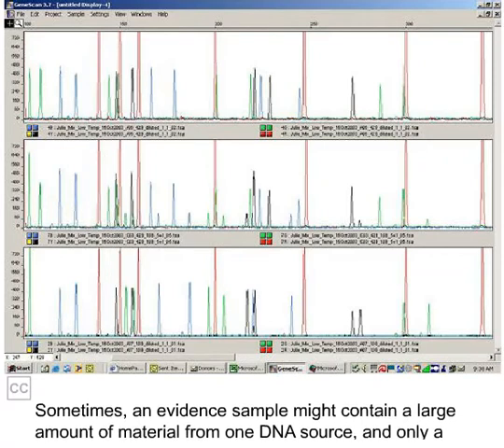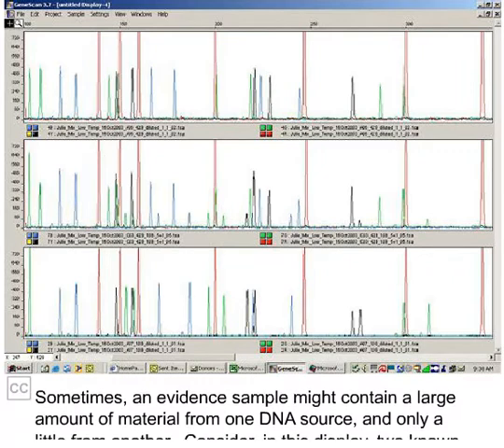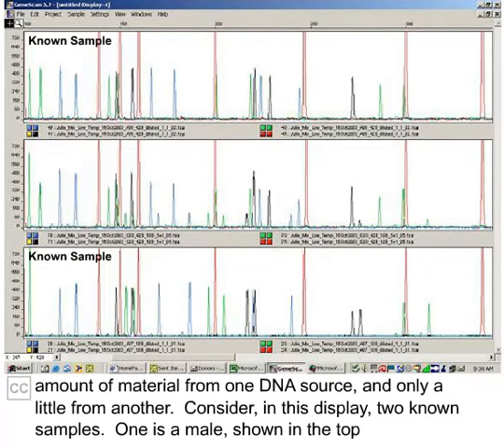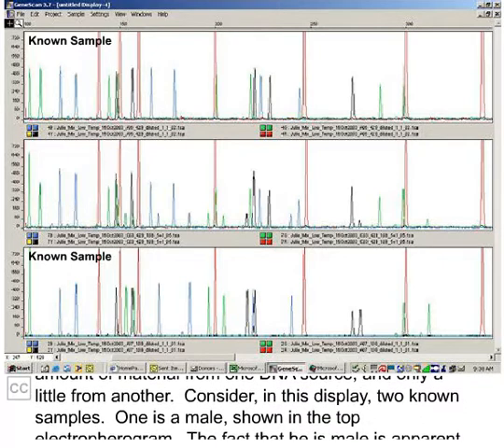Sometimes, an evidence sample might contain a large amount of material from one DNA source and only a little from another. Consider in this display two known samples.